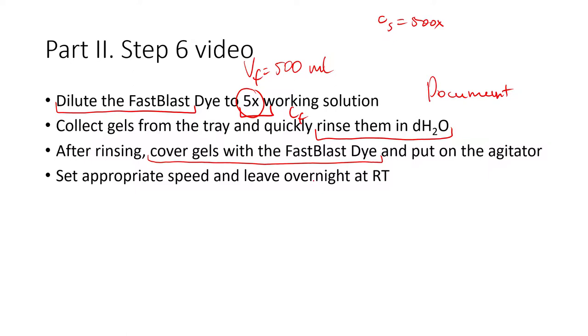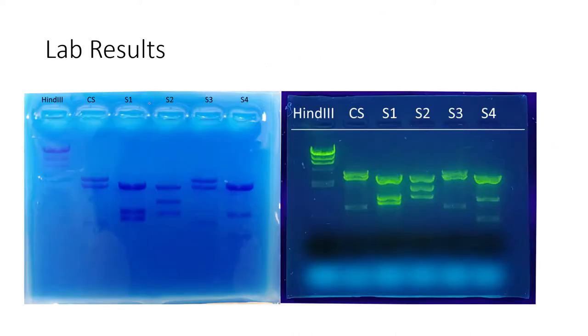You should cover your gels with the fast blast dye otherwise they will easily dry out and you will not be able to take a picture of these gels. You usually put it on the agitator or the shaker. You leave it overnight. After you put it on this shaker you should set the appropriate speed because if it's too much the fast blast will be spilled from your gel holders and they will dry out so be careful with the speed of the shaking.